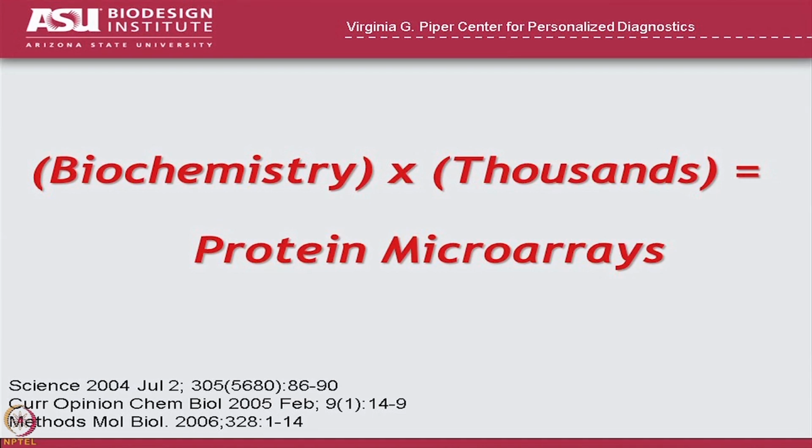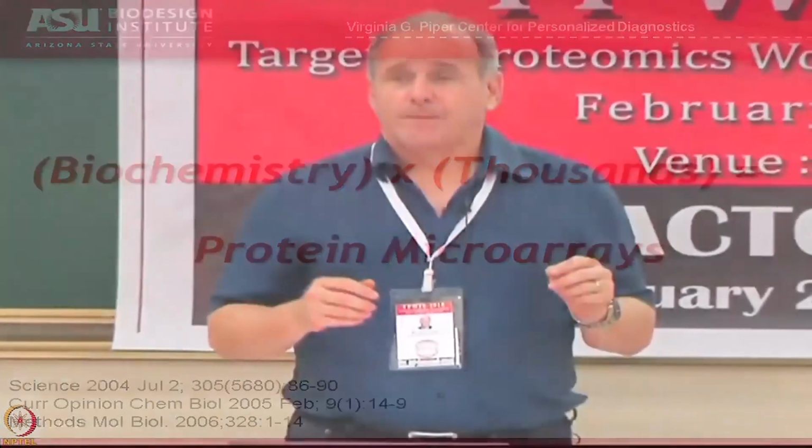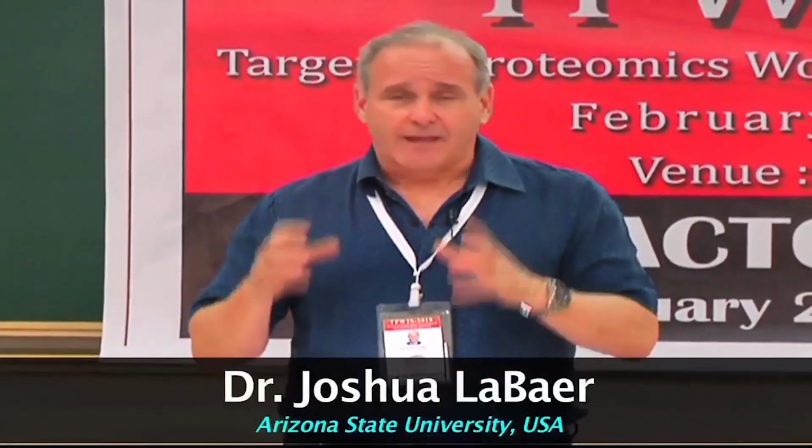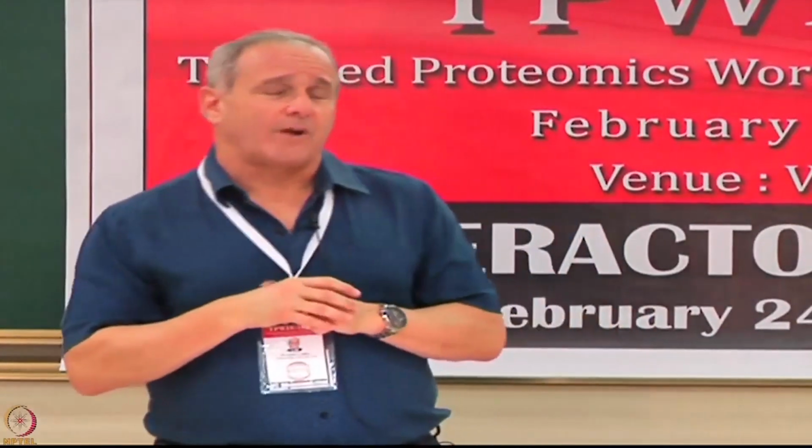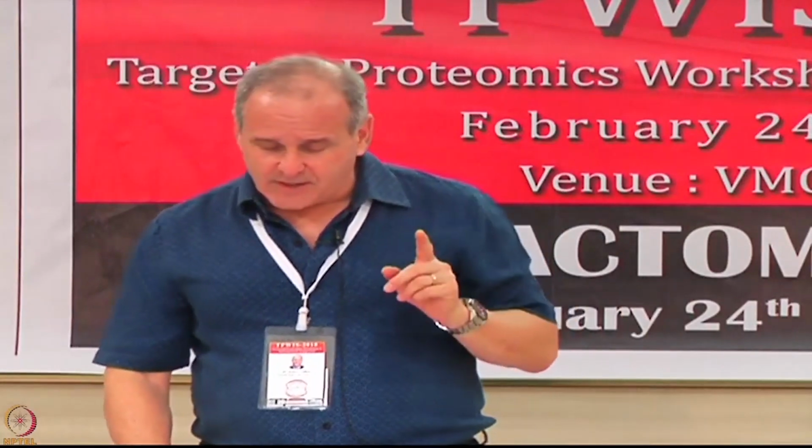Just to give you some perspective, when we first began this work, we actually started by trying to do high throughput protein purification. We were developing methods to make proteins in bacteria, lyse the bacteria, capture the proteins on columns, elute the proteins, and then study them in high throughput. Believe it or not, we still do some of that work for other reasons, but we realized very quickly that it's hard to do high throughput protein purification. If you try to isolate lots and lots of proteins, first of all, a lot of the proteins don't purify well. Secondly, most of the proteins don't give you very high yield. And third, you don't really know if the proteins that you're purifying are going to be of high quality, folded, and active. So that's what led us to this idea of protein microarrays.